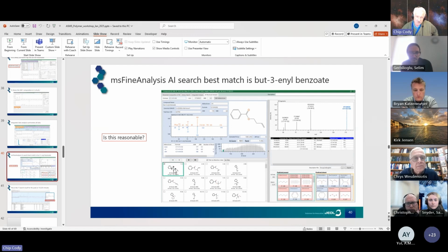We've got three scores. One's the cosine match score against the calculated spectrum. One is the number of substructures predicted and present and absent in the structure based on the fragments and the neutral losses. And a third one is a weighted score. It says PROB, but it's not a probability because it has negative scores. It's really just a weighted score, giving some structures more value than others. So the library database is a local 60 gigabyte database that sits on the local computer, and then the other local AI here tries to predict presence and absence of structures.